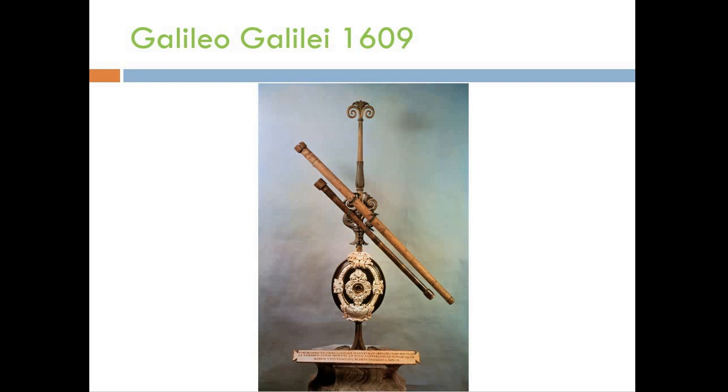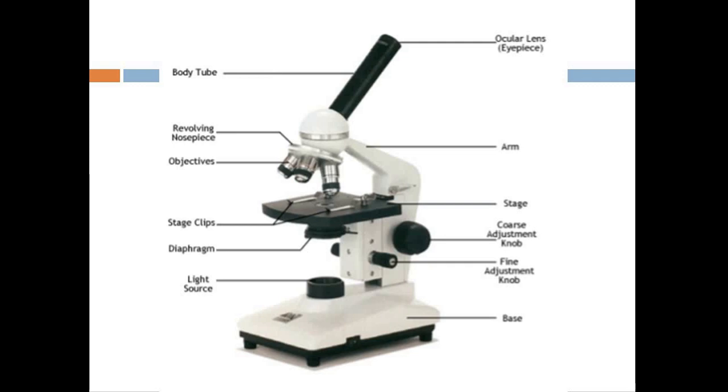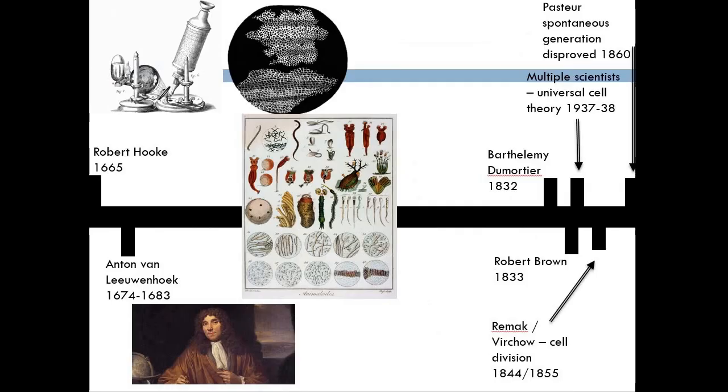There's a long development of microscopes that started almost from the Roman times, in which they started to use glass, and there are some reports from previous to that in the 13th century. One of the first discoveries of what we call the compound microscope is from someone called Galileo. Now, you may have heard of him before. In 1609 he produced the first compound microscope, and that takes us from there to what we're at now. This should be reasonably familiar to you in terms of the light microscope, still a compound microscope that we use in schools. So we're going to look at the development of this microscope now.